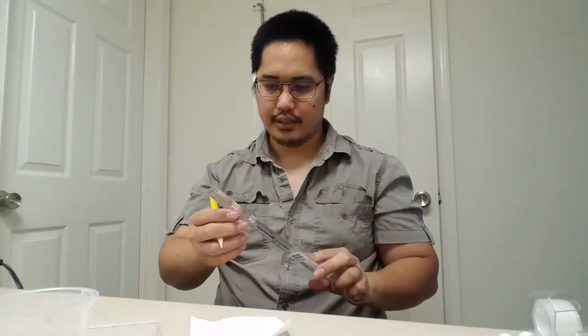So let's see what they have. All right, what we're going to do is we're going to take some copper nitrate and some lead nitrate, and we're going to put it inside of a bin. Oh, first thing they want you to do is set up the guide for this.